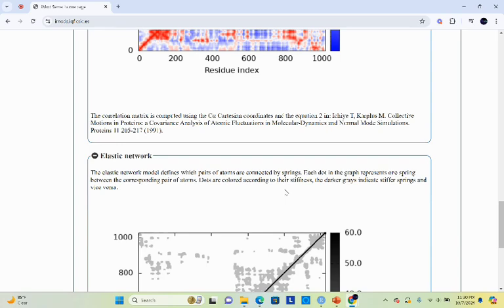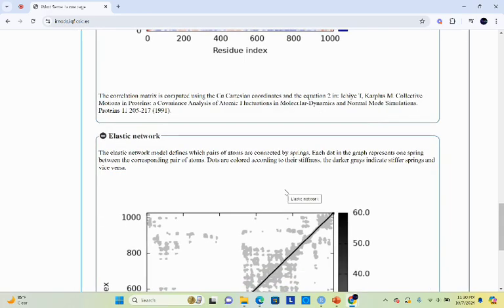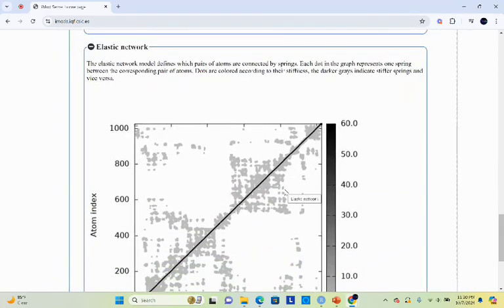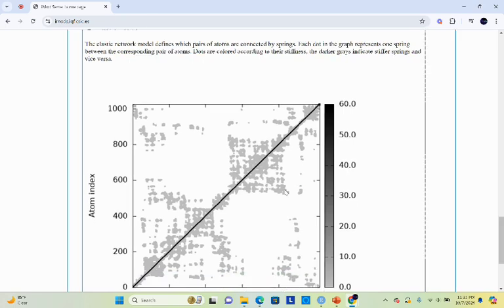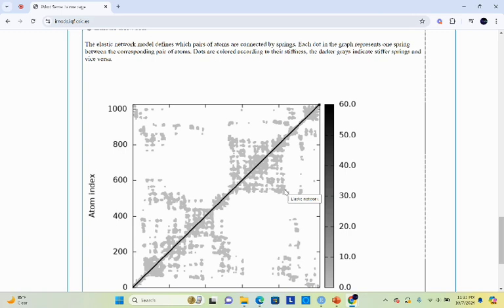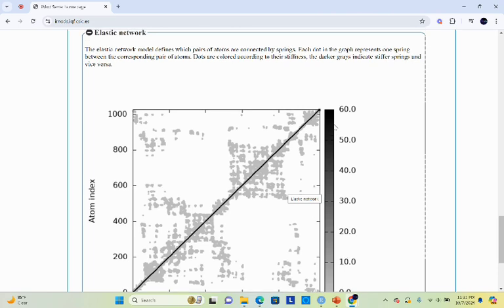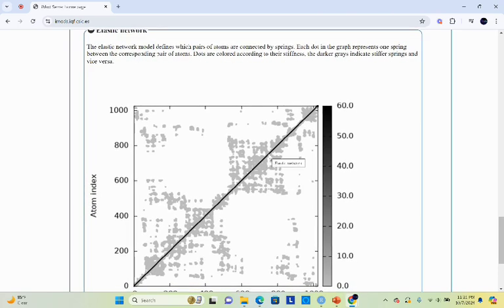The last one is the elastic network model. Elastic network model defines which pairs of atoms are connected by springs. It is a simplified representation of protein dynamics, where the protein is treated as a network of interconnected nodes that can move relative to each other. iMode gives us this elastic network to show how different regions of protein interact and move in relation to one another. This network can help identify elastic sites as well as regions involved in interactions across the protein structure. This is important for understanding biological function and mechanism. Here gray color indicates stiffer springs and white color indicates that the springs are not stiff.